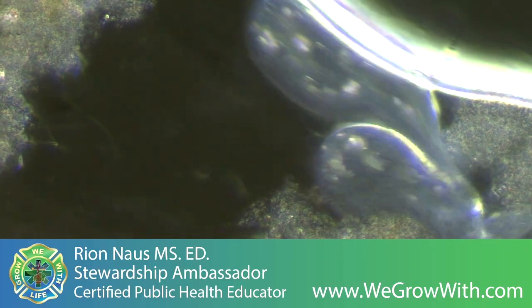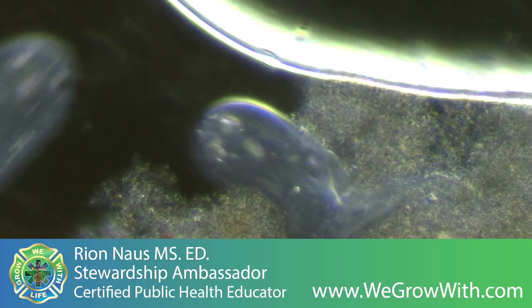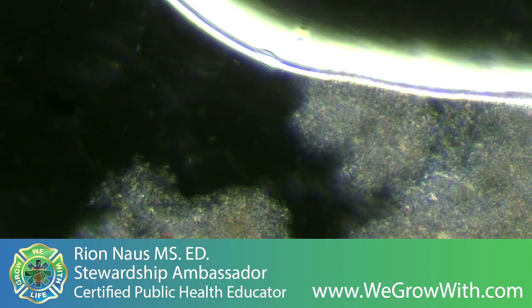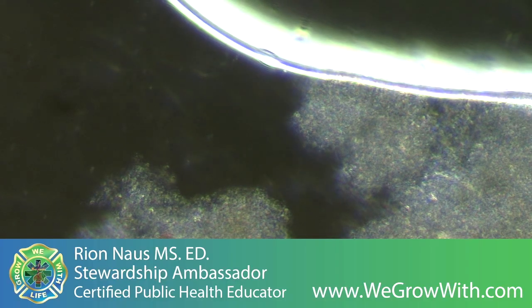Oh, so close. They think they might actually utilize that pocket, you know.